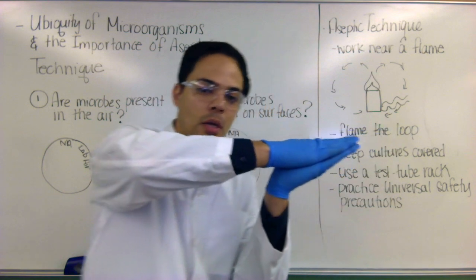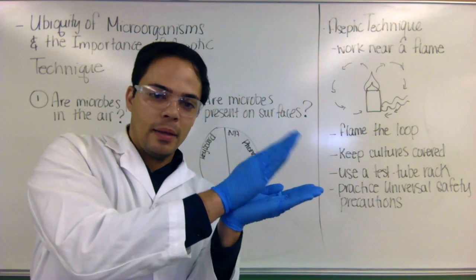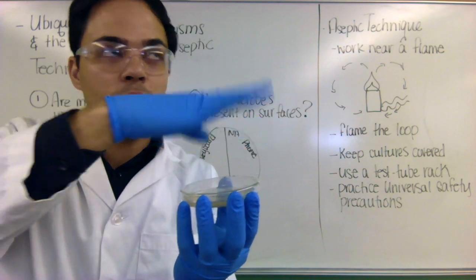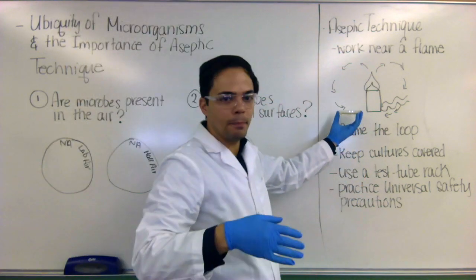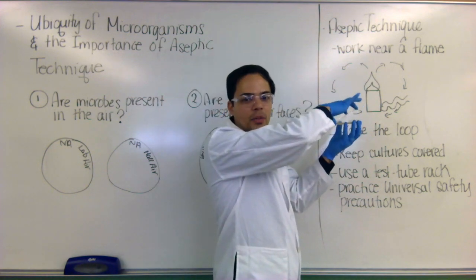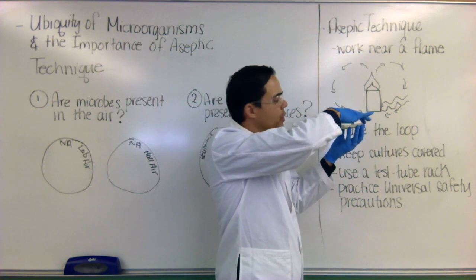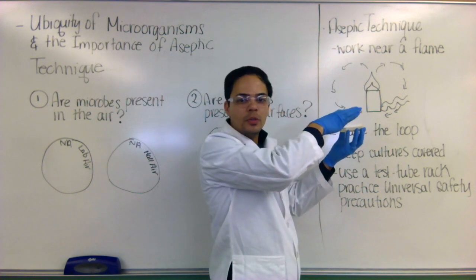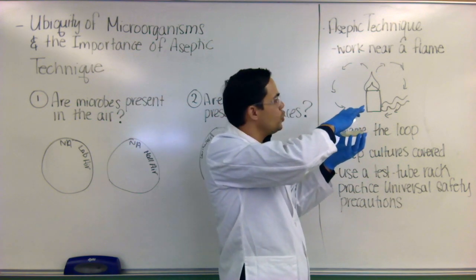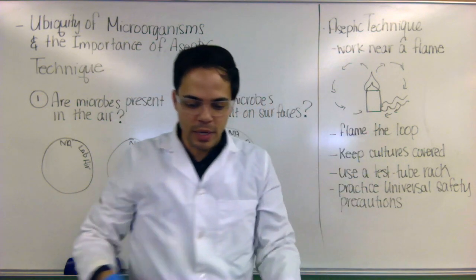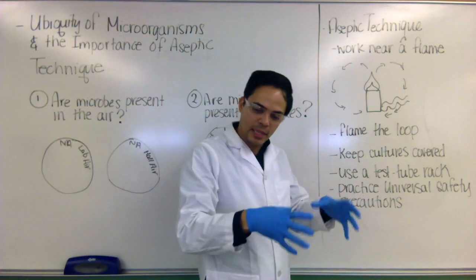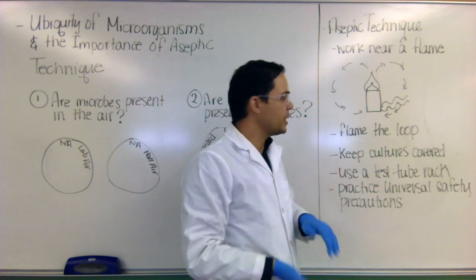Clams have their bivalves, right? So they open like this. So imagine your plate is a clam and we're going to open it to the air. So what you would do is be next to your flame. And then you just clam shell it. So open it like a clam and then close it. So whatever you need to do, whether you're observing it visually or you want to inoculate this plate, just open it enough to do your inoculation and then close it. And that way you don't have to take off the lid and put it somewhere. It stays with the plate and then you're closing it right away.